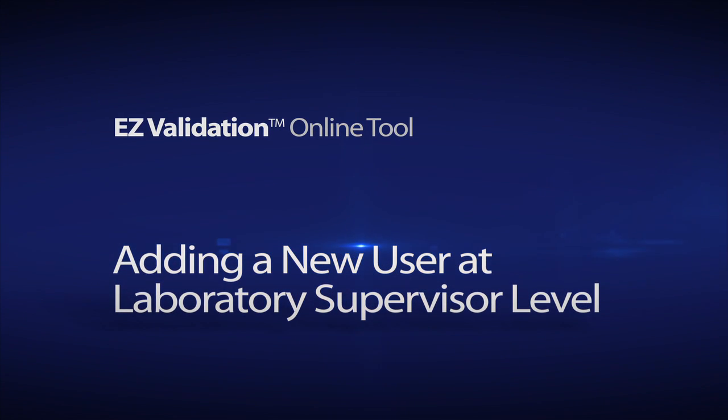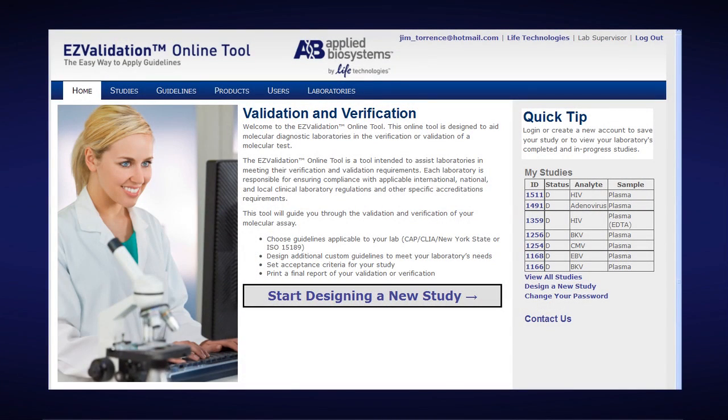Setting up new users on EZValidation Tool. To set up new users on the EZValidation Online Tool, you have two options. One option is to go into an existing study and assign users.